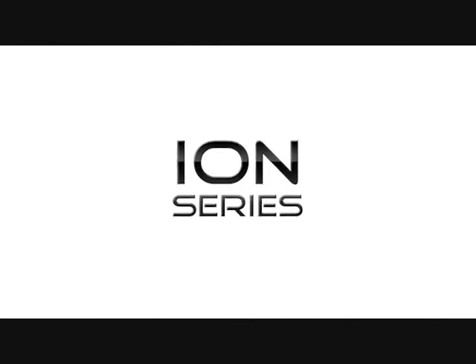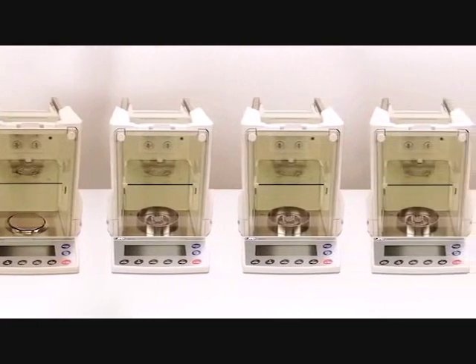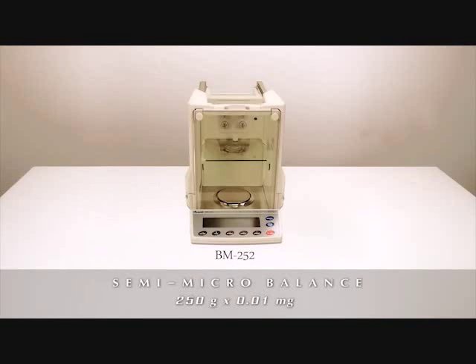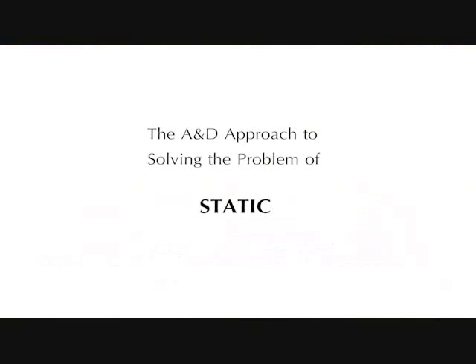With this in mind, A&D developed the new ION series to meet these challenges. The ION series consists of six new models: three analytical balances with capacity up to 520 grams, a semi-microbalance, and two microbalances, including the BM20 with its 22-gram capacity and one microgram resolution.